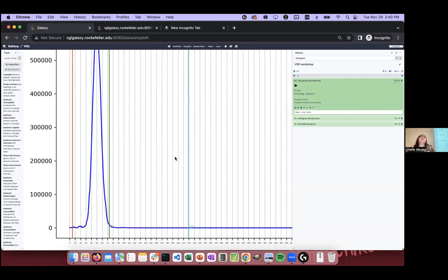There shouldn't be anything to purge in the alternate, yeah, because the purging is getting rid of duplicates, but we shouldn't have duplicates in the alternate at this point. So we don't need to use the transition parameter. But we still want to keep this upper bound, because anything above here would still be super covered repeat. Does that make sense?